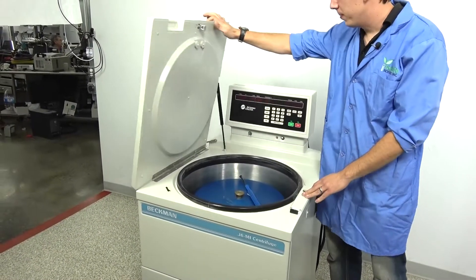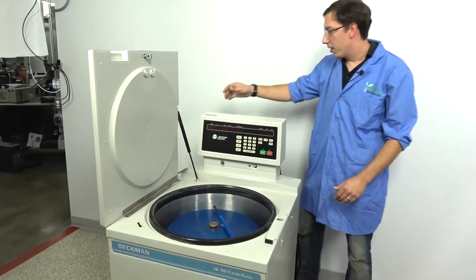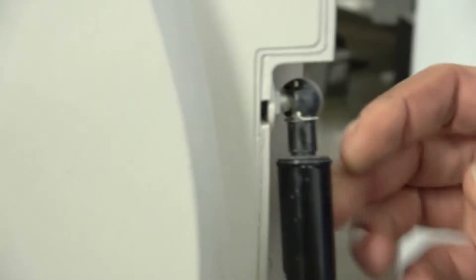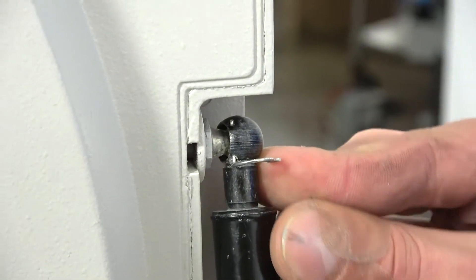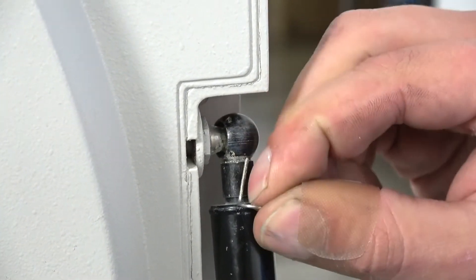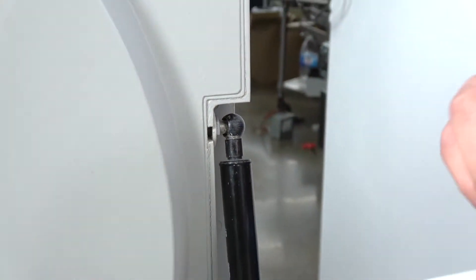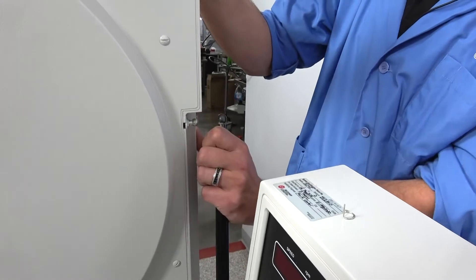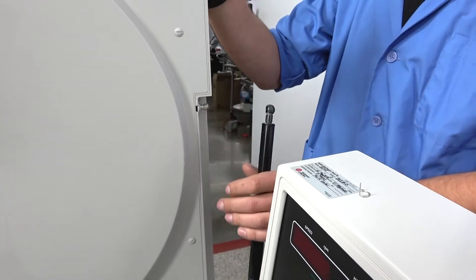So if you want to fix this problem, you'll just want to come back here and you have these little pins. If you reach around the back side you can flip it outward like so and you pull it down. Keep a hold of this pin and then you can take this right off. You'll want someone else to hold the door.